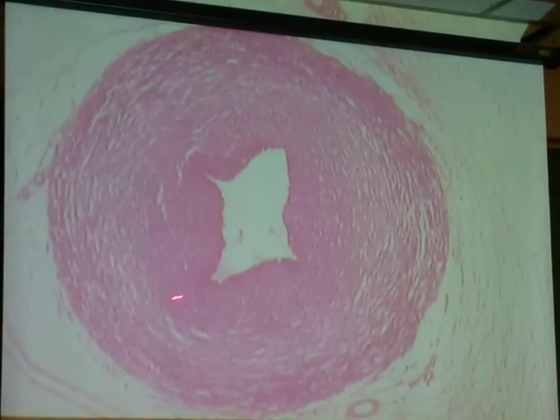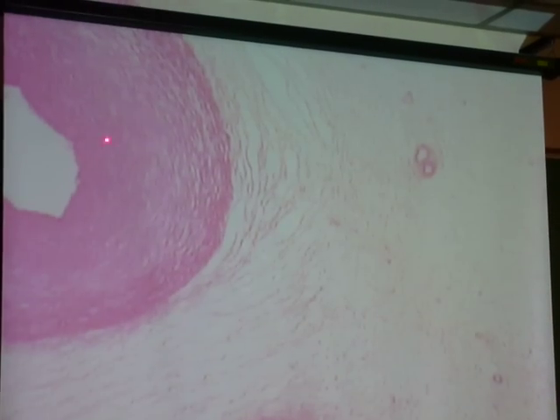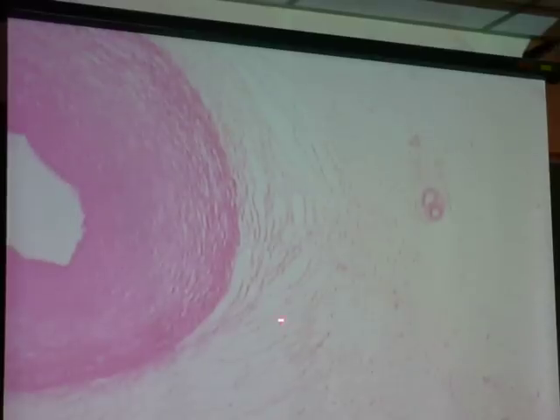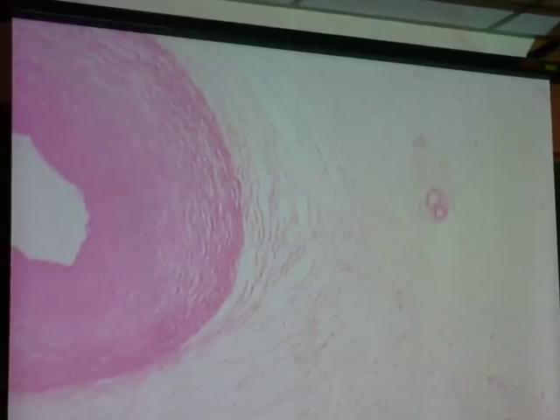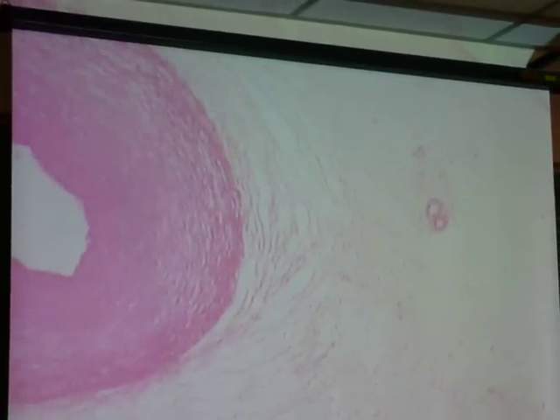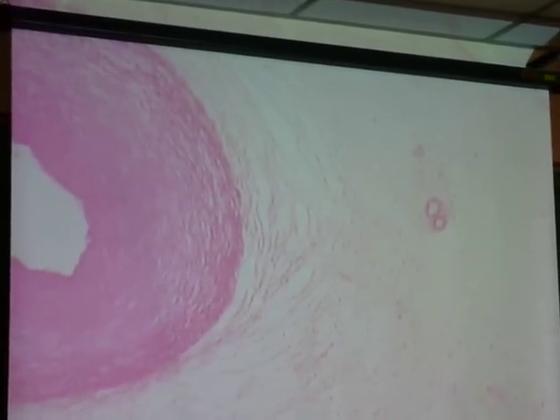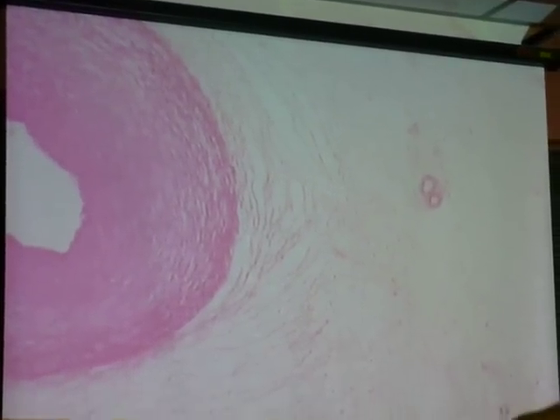See the artery here is really dense with layers of tunica media. We go up here, same thing here. What do you call all this connective tissue? Wharton's jelly. That's all Wharton's jelly there.